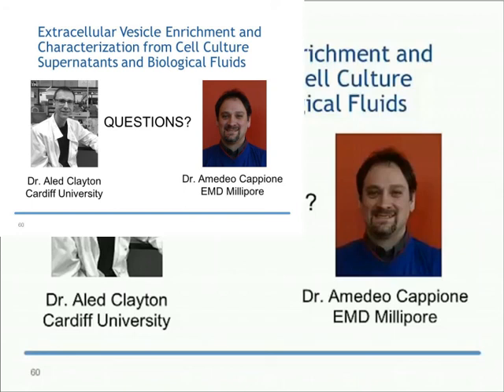So if the sample preparation is replete with non-vesicular contaminating protein, then that ratio measurement is very low. If, however, you've got hardly any soluble protein there, you've only got your vesicular protein, the ratio is simply much higher. So we described this in a paper in JEV, I think it was early 2013, and it's a very, very simple, quick and easy approach to do this. Rather than having to look at the structure of the vesicles and then perhaps do a series of Western blotting, looking intentionally for potential contaminants in the system, it's a very quick and very convenient way of doing this.